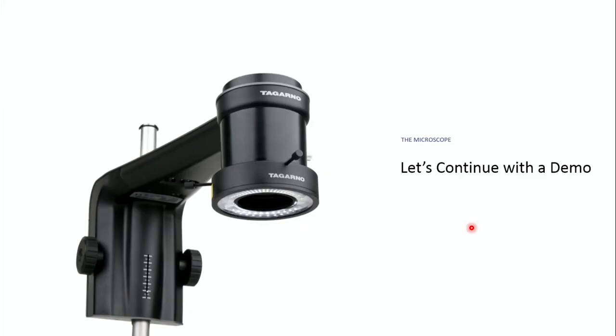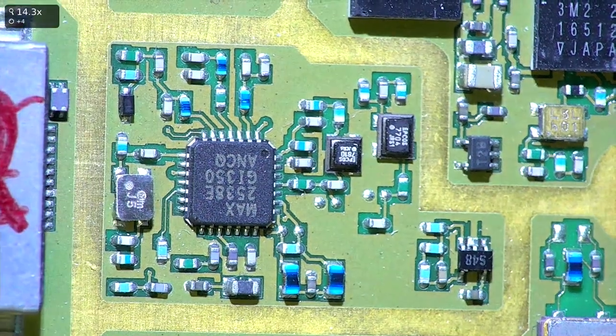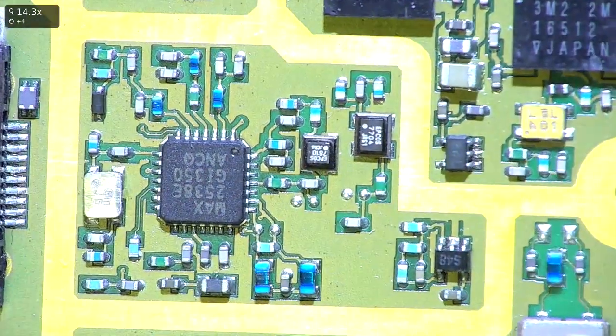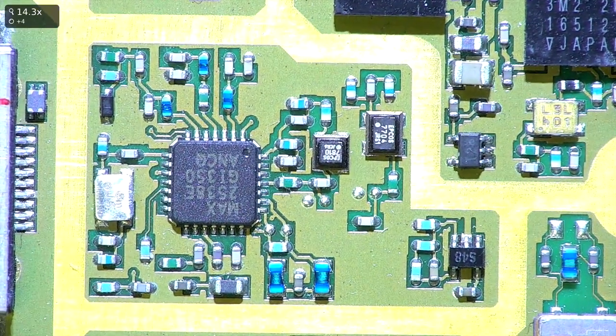Now I'm going to switch over and do a demo. So we'll switch my video. And there, now we have the microscope. We have a live image. I know we talked about zero lag. It's certainly zero lag here. I don't know how it's turning out at the end of the internet on your desk there.